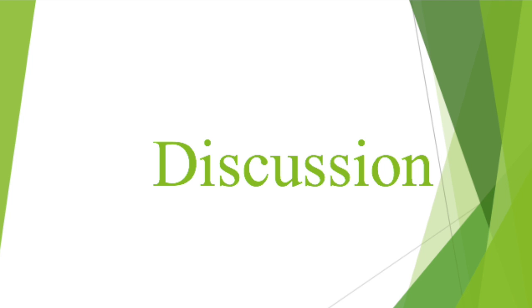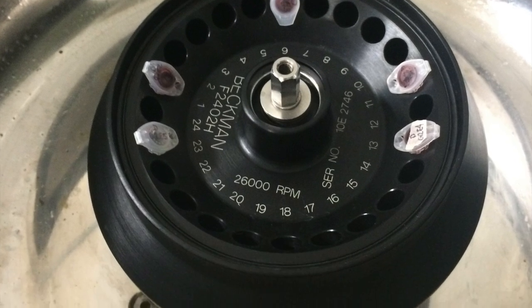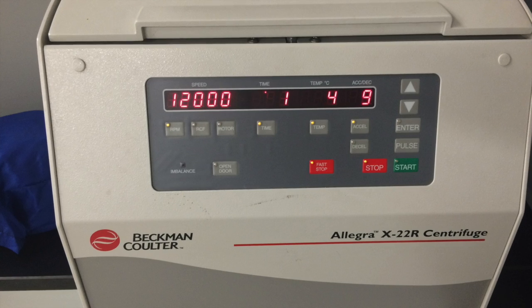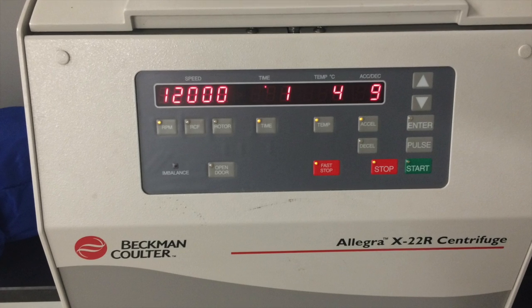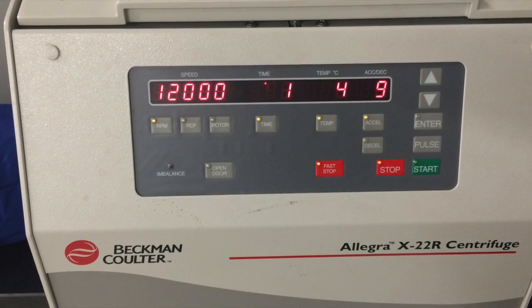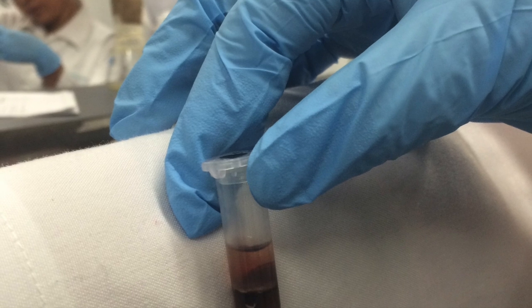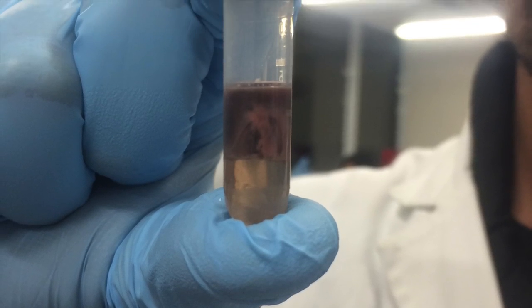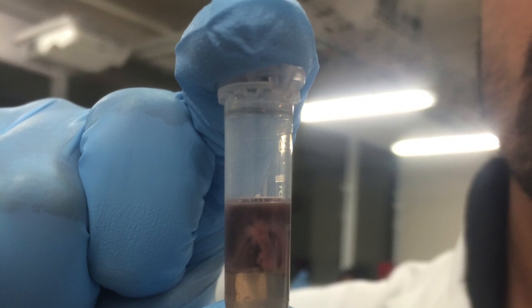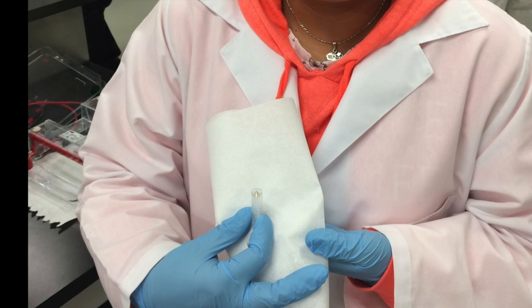Comparing both protocols, the main differences between procedures lie in incubation periods, spin speeds, and number of centrifugations, the use of different extraction buffers, different precipitation substances, among other things. The differences in the protocols are because of the complexity of the cells from which we are obtaining DNA and RNA samples, also because of different molecular weights and interactions within molecules and the medium, the presence of DNA digestive enzymes or RNA digestive enzymes, and therefore the different inhibitors for each.